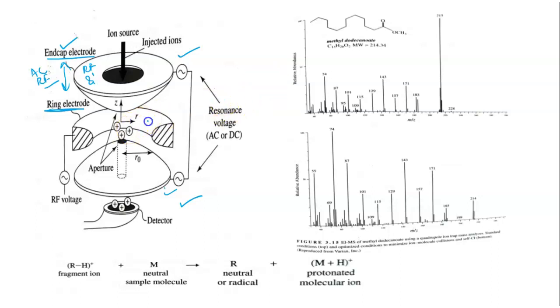You can see over here these ions are getting ejected from the trap in the axial direction towards your detector like that. Okay, so these ions have now reached your detector. So what is happening, this particular process where the sweeping of your RF potential results in the removal of ions with increasing mass by charge value, it leads to the unstable trajectory, and because of that your ions will eject, and after ejection they are going to get detected in your detector.